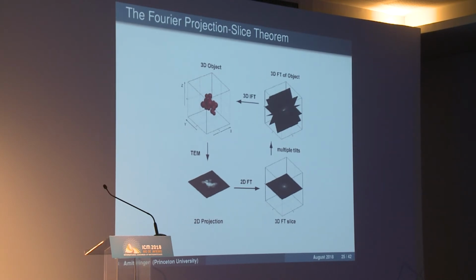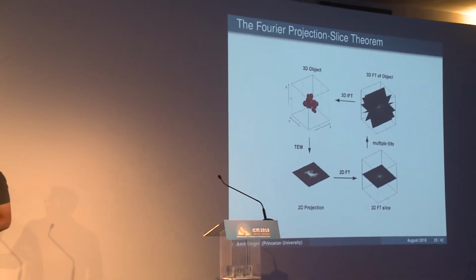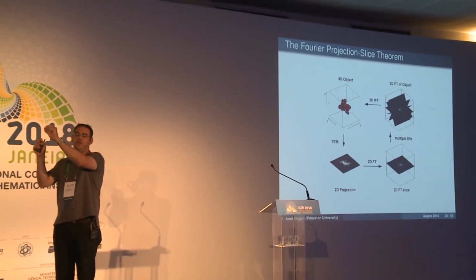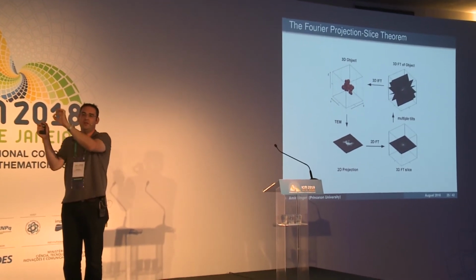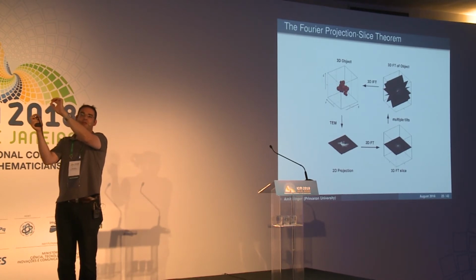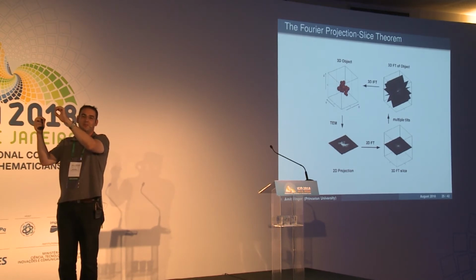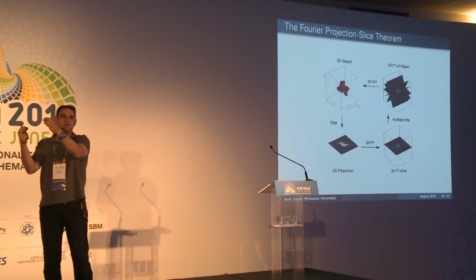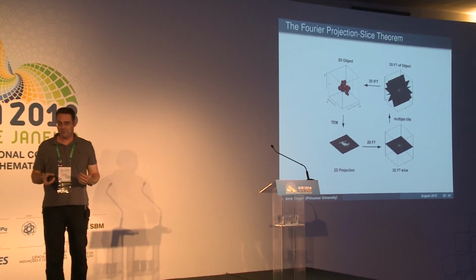The reason is that, remember, we can consider images in the Fourier domain. When we correlate any two frequencies, which correspond to some 2D frequencies in 3D, you just multiply them. And now every image will correspond to 2 different 3D frequencies, but they are all related by a group action. So when you sum over all of them, basically what you've done is Monte Carlo integration over the rotation group SO3. Monte Carlo integration of what? Of just the Fourier transform of the molecule times itself. This is the autocorrelation function.